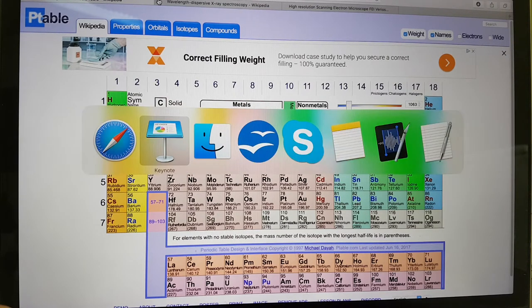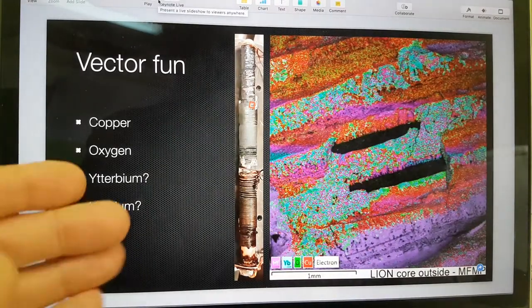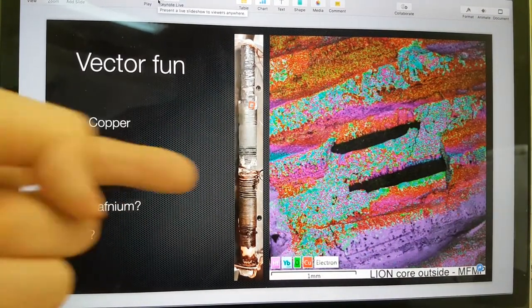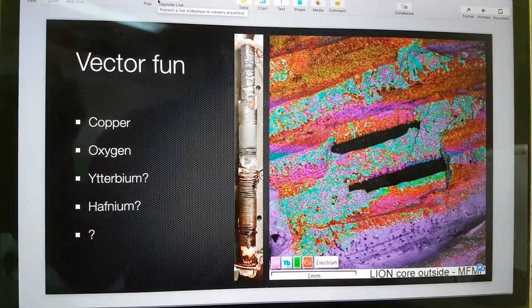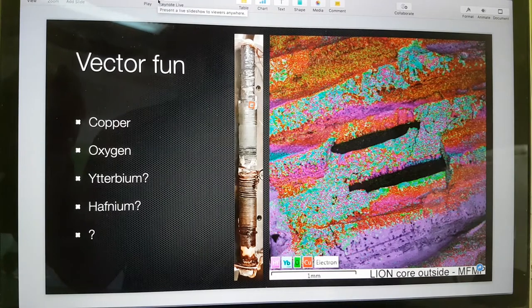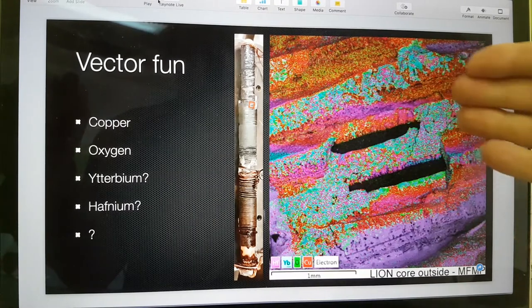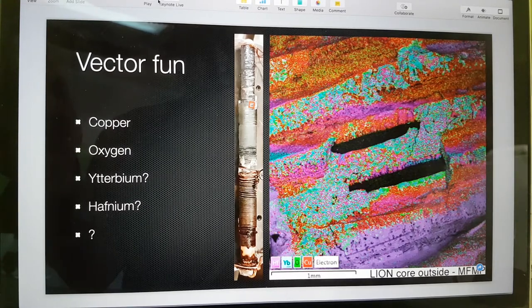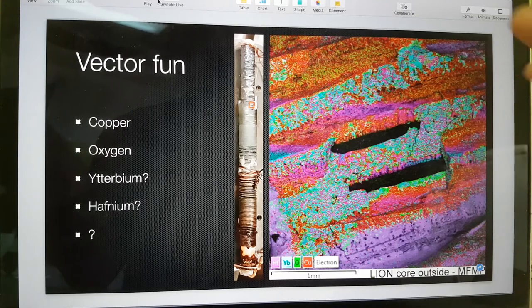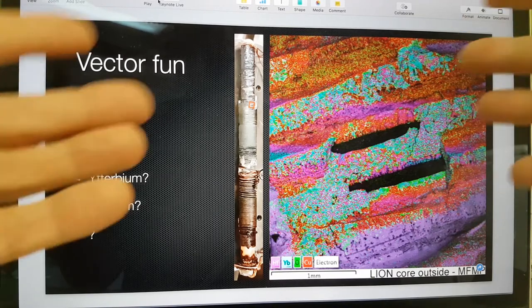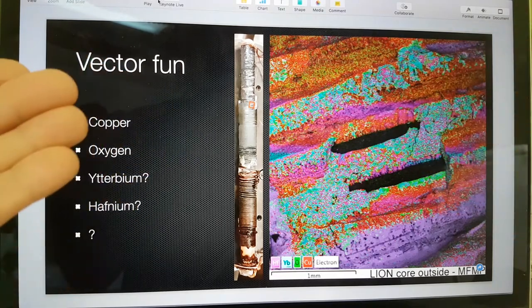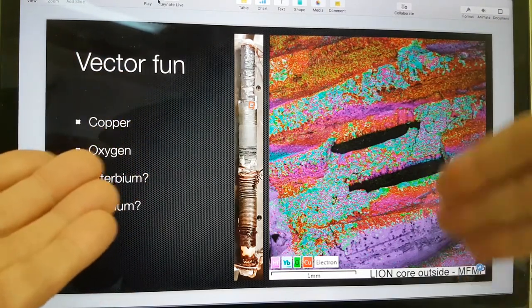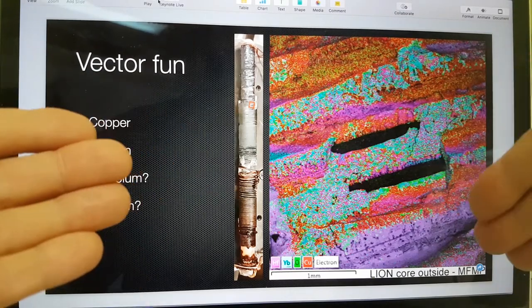What I want to draw your attention to first is this, which is some analysis from the Lion 1 reactor. Here's the Lion 1 reactor. We're looking at this little area here. This was in the tractor beam video, which is on our YouTube. And it was showing on this cupric Cu2O oxide, some other elements.